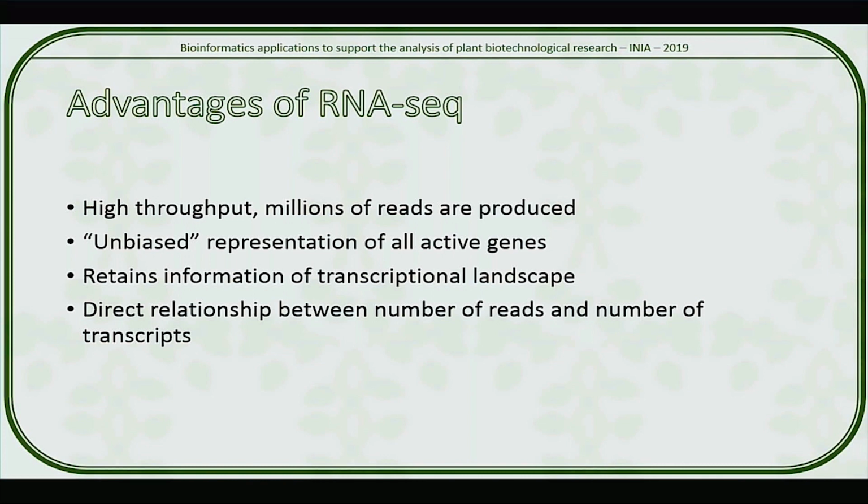Second, it's unbiased. This is a fun word, because it was only after Illumina machines or older machines were actually used in research that you find the biases inherent to each of these machines. There are GC biases, areas that are AT rich or GC rich that cannot be sequenced easily, and that are not represented as deeply as non-GC rich regions.